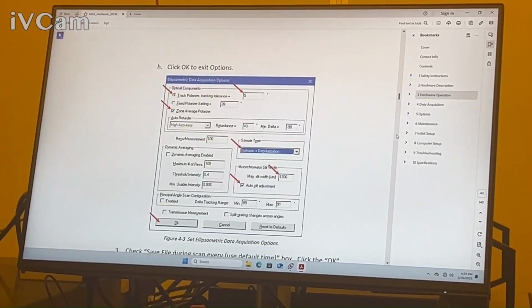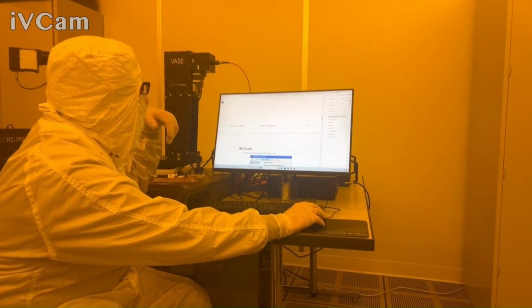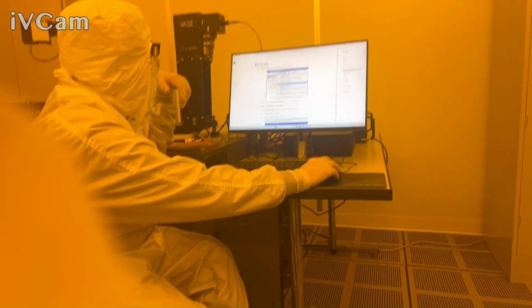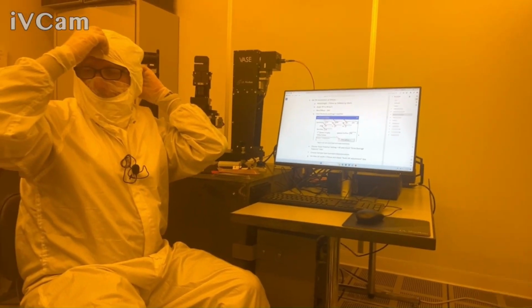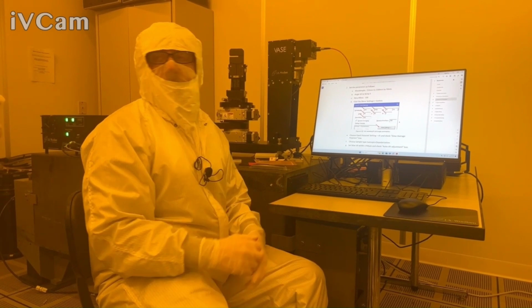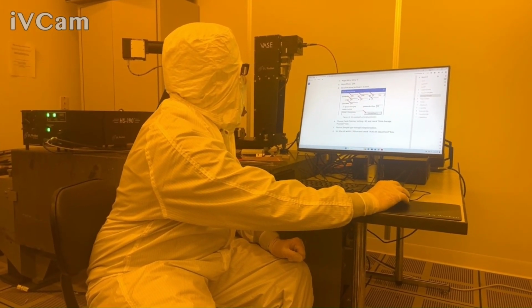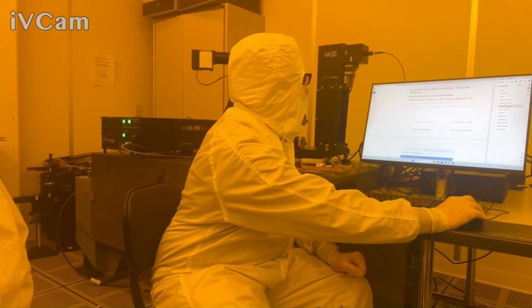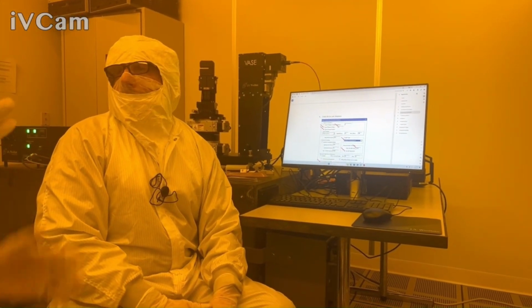So what additional information, for example, let's say I'm doing a semiconductor measurement, like silicon, you look at the transitions, like the electron transition, where it occurs. Would this kind of equipment not give me that kind of information? Possible.